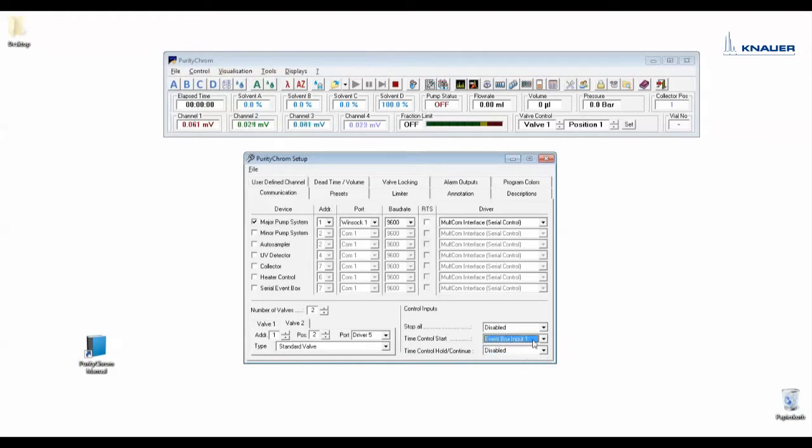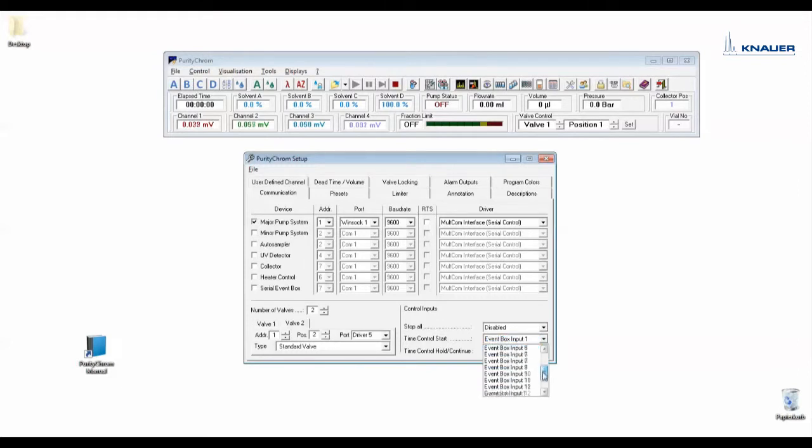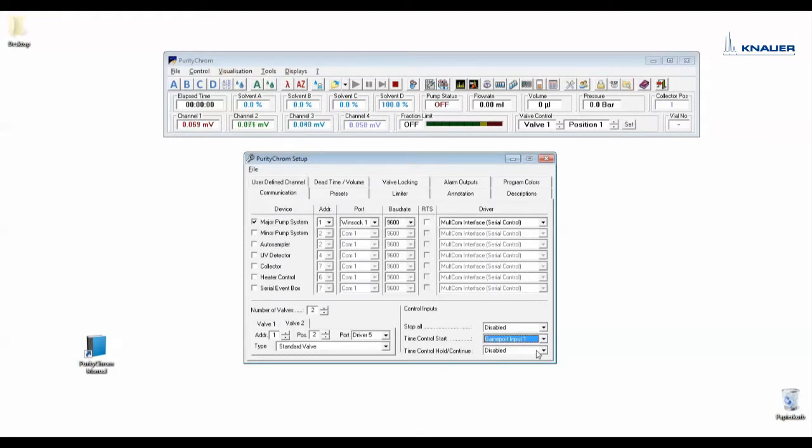And for a signal from the game port adapter you have to choose game port input 1, 2, 3, or 4. You have here the possibility to stop all depending on the signal, to start a run, or to put a run on hold.